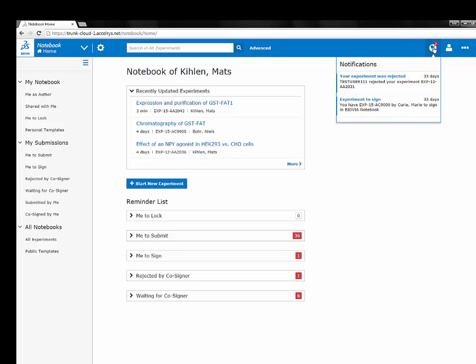On the very right of the navigation bar you have a new feature: Notifications. Here you get an up-to-date list of things that need your attention. For example, an experiment that needs countersigning or an experiment that was rejected by a colleague. Eventually other applications will be able to post notifications here.